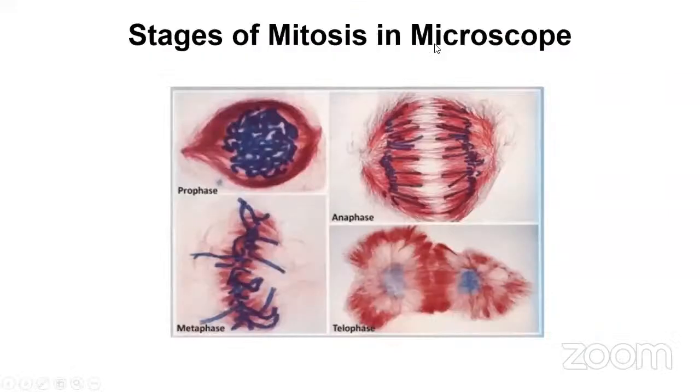So just now you all saw how to observe mitosis using onion root tip. But now there was a small problem in the video which was shown to you. The problem was that you saw what all the requirements are for starting to observe mitosis under the microscope. Like you needed an onion root. So what you did in the beginning is that you placed the onion into water for 3 to 6 days so that the root tip starts to grow.